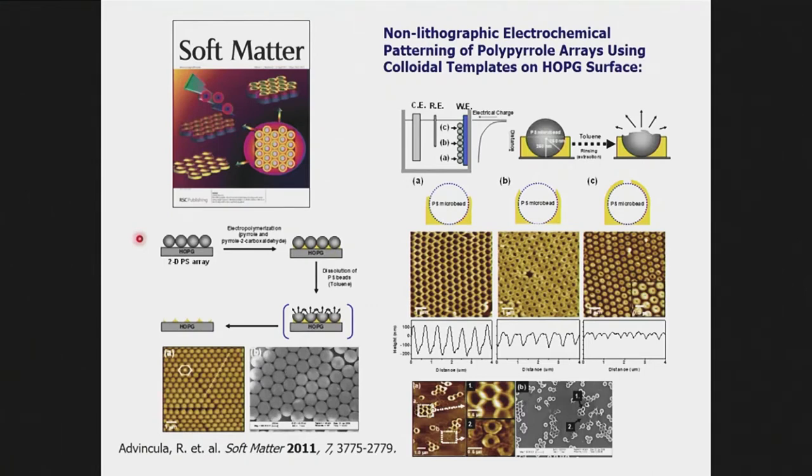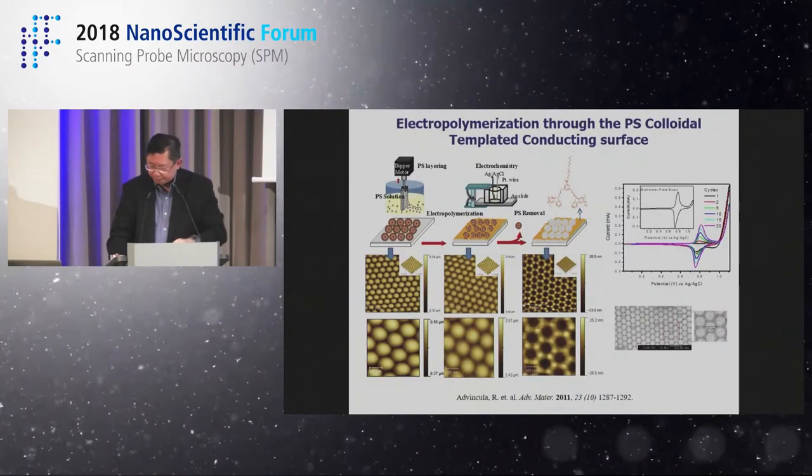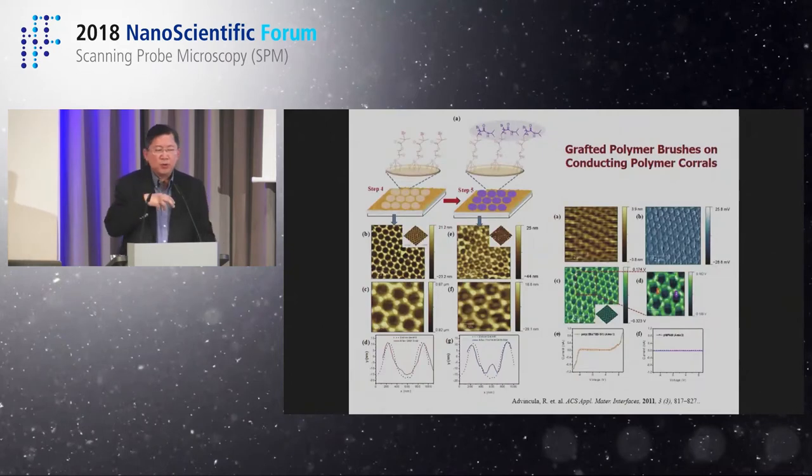Well, another interesting thing is we can, again, make these patterns here. We can deposit this bifunctional carbazole group and make these conducting polymer lines. These conducting polymers, as seen here, can be deposited by cyclic voltammetry. But since the middle or the core is still a hollow ITO surface or gold surface, we can grow another thing inside those.